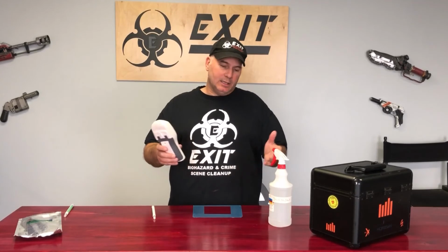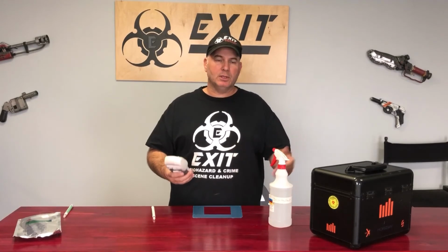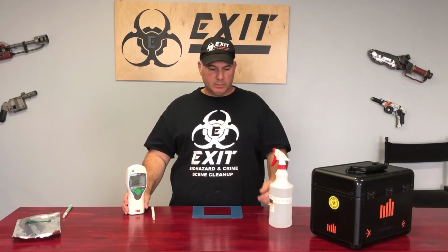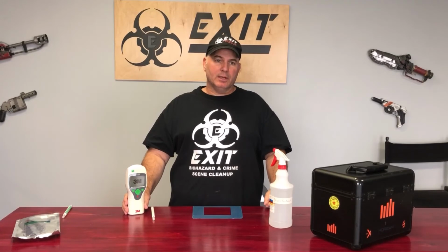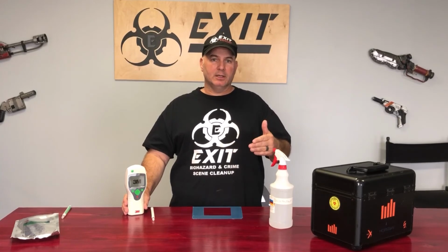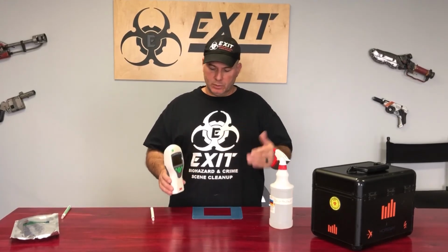So again, ATP testing isn't for everybody. It's not for every job that we do. But it's just something I want to point out because it is pretty important, and it lets you know where you stand. Okay, and like I said, if you want to go into other areas where you have to literally prove that your cleaning techniques are working, you're going to do that.